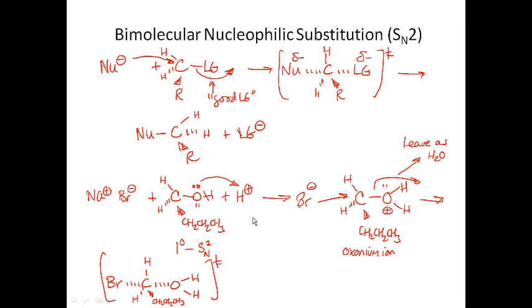Now our bromine is going from, and let's just write the final product here so it's easier to see what we're doing. I'm going to end up forming the bromine-carbon bond, and now I'm going to end up with my CH2, then my CH2, CH2, CH3, so I'm going to end up with 1-bromobutane and my water molecule, which now was the leaving group.